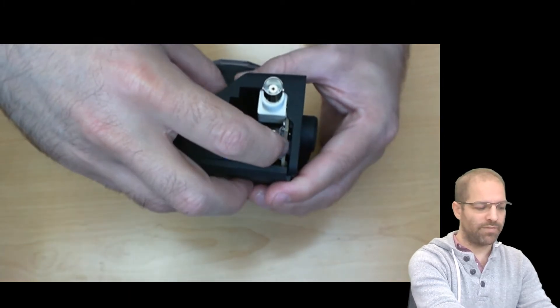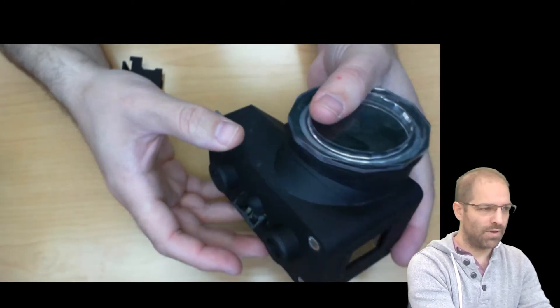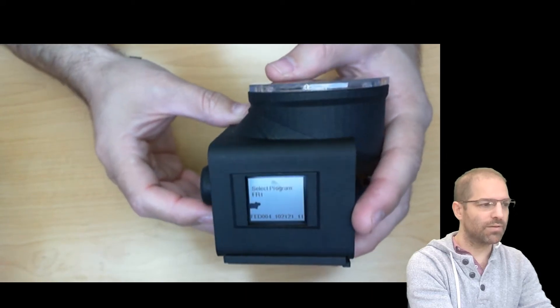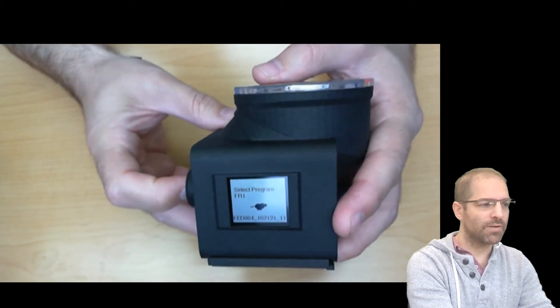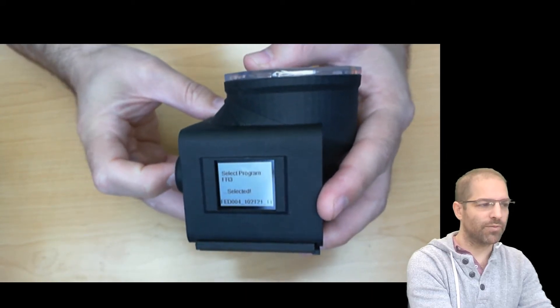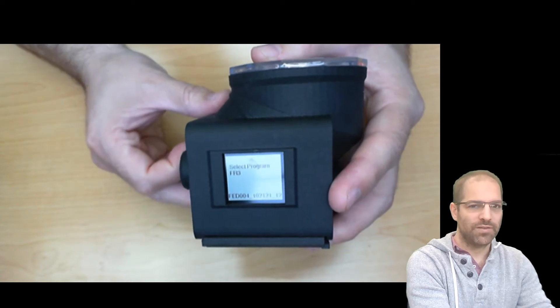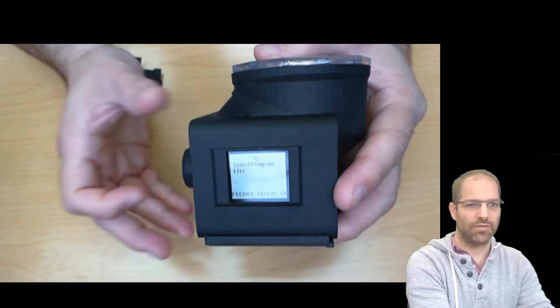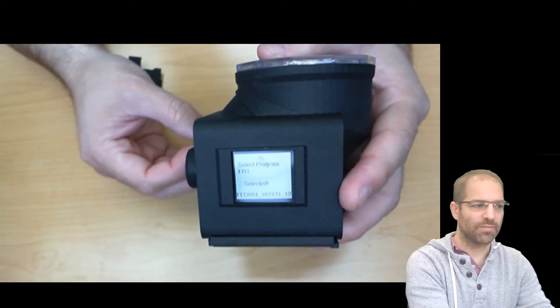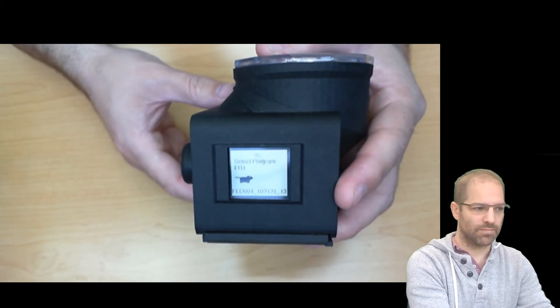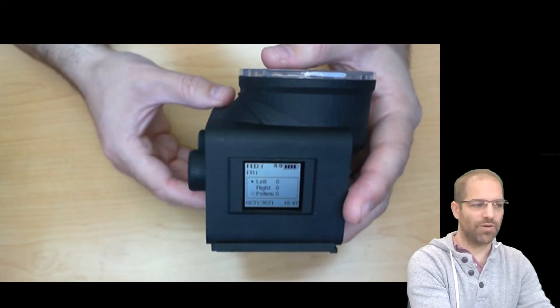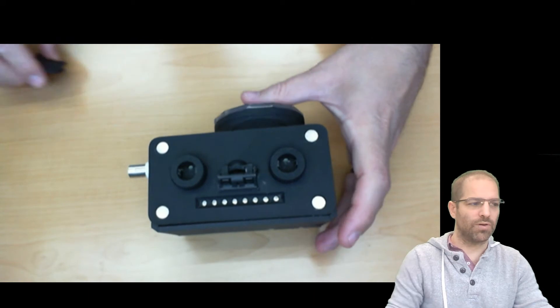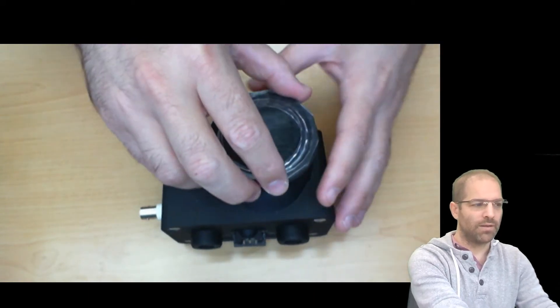If I turn FED3 on, then we look at the screen. At startup, you can select between several programs. FED3 is also open source, so you can also customize your own programs. That's an FR1 program, meaning one poke will result in one pellet.